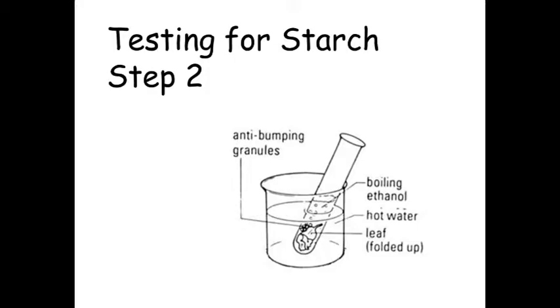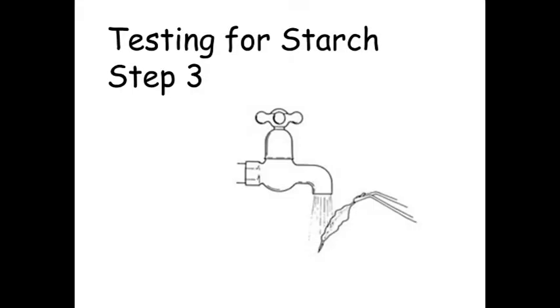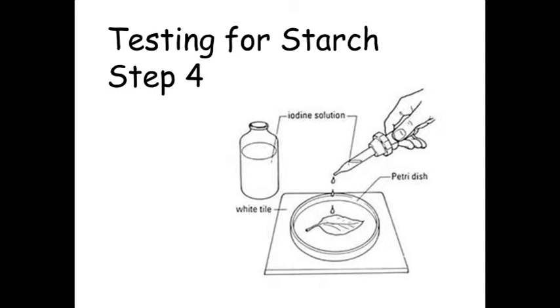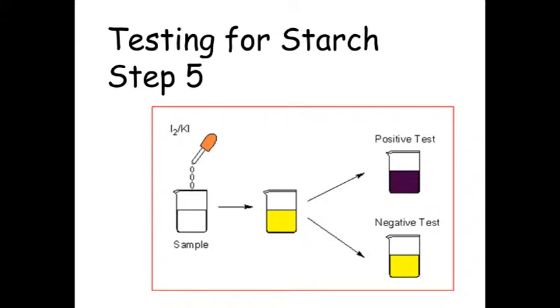Now place the leaf in a test tube of ethanol, which is heated in a water bath. The chlorophyll can now be absorbed by the ethanol. After a few minutes, remove the leaf and rinse it. This will remove the chlorophyll and make the leaf less brittle. Iodine solution is orangey brown, but when it reacts with starch, it turns blue-black. This is a positive test for starch. If starch is present, it is because glucose has been made, and this is what confirms that photosynthesis has taken place. We will now highlight how this can be used for each factor being tested.